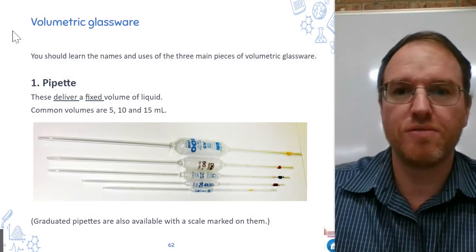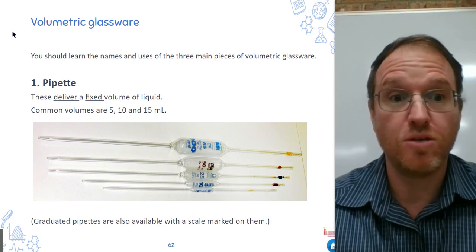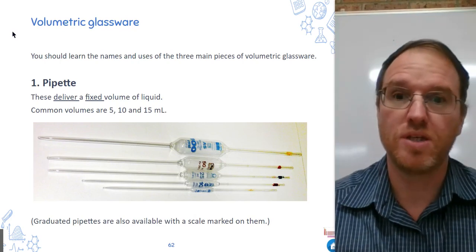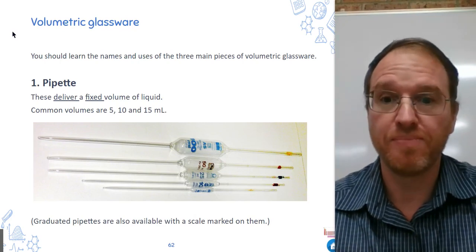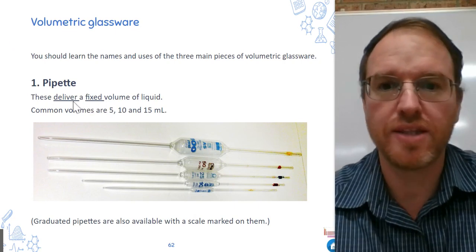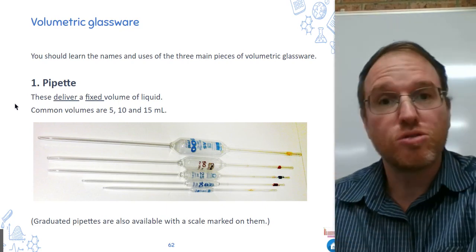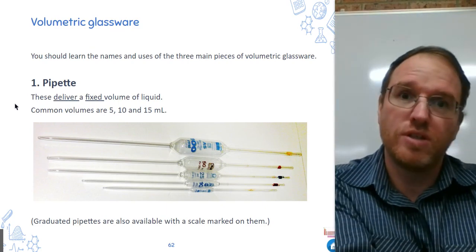So what are the 3 bits of volumetric glassware you'll be using? You need to learn these 3 and their uses in Year 11, and then you'll use them in Year 12. First one is a pipette. These are for delivering a fixed volume of liquid. I've underlined those 2 words, deliver. So it's not for storing or for a reaction, just for transferring the volume into a different container.